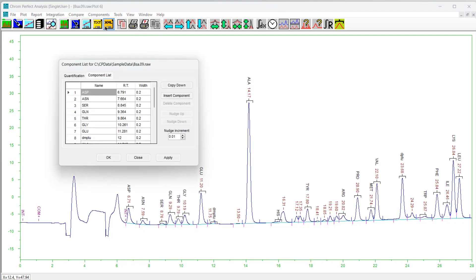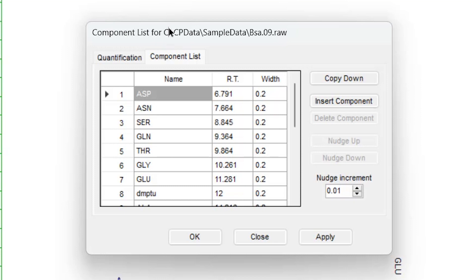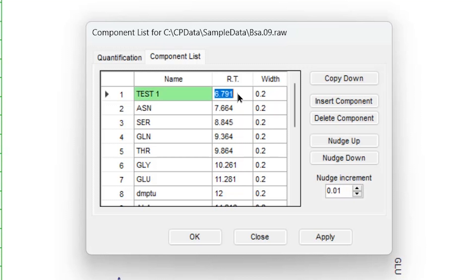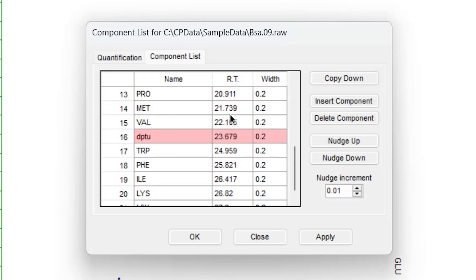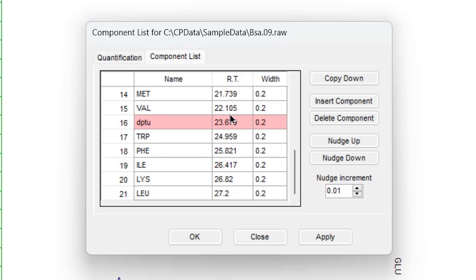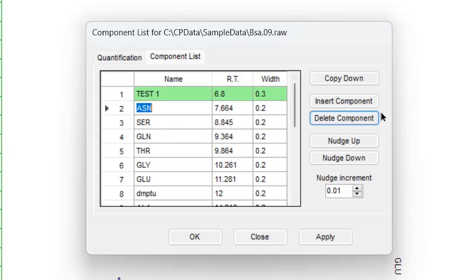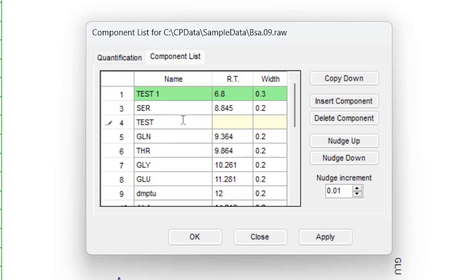To edit the component list, choose Components, then Show Component List. The following form will appear. This list shows the name, expected retention time, and window width of all components in the calibration file. The names and numbers may be edited in the usual manner. Components that serve as the default component or as retention time references or internal standards for other components appear highlighted in pink and cannot be deleted.